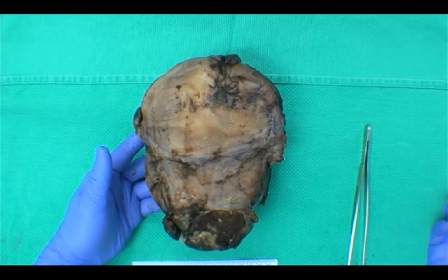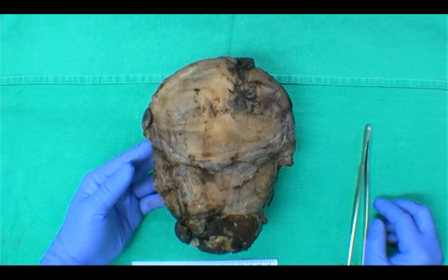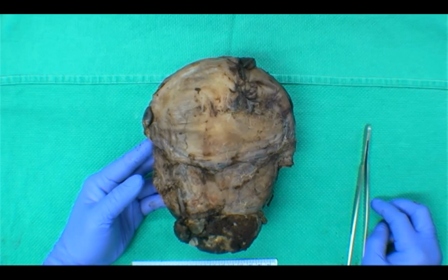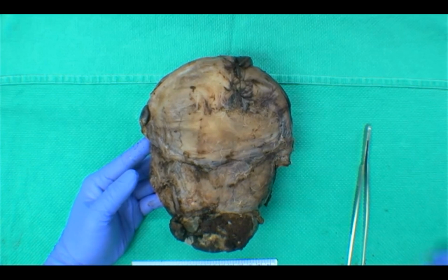The important thing to note when you're approaching these specimens is to pay attention to the interface between the placenta and the uterus, because that's really the most important part, right? Because we want to properly document the relationship between the placenta and the uterus and how far the placenta is invading into the myometrium, if at all.